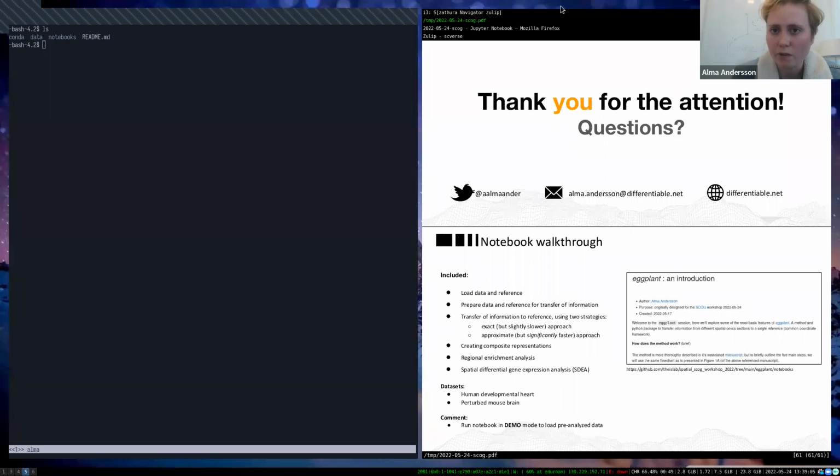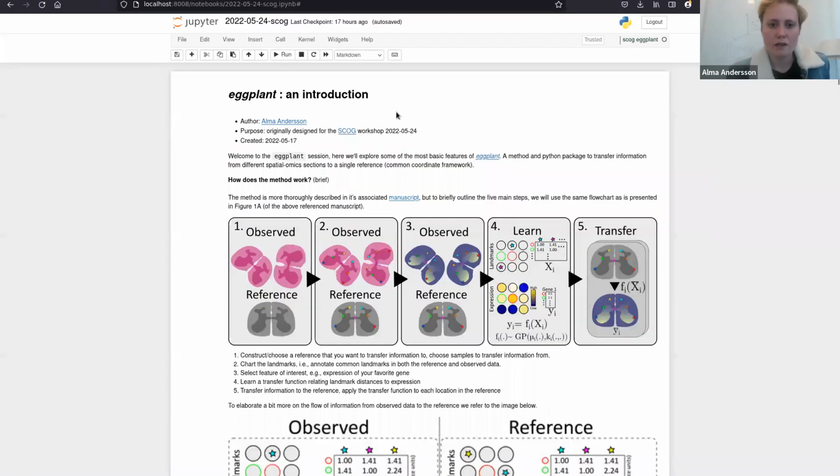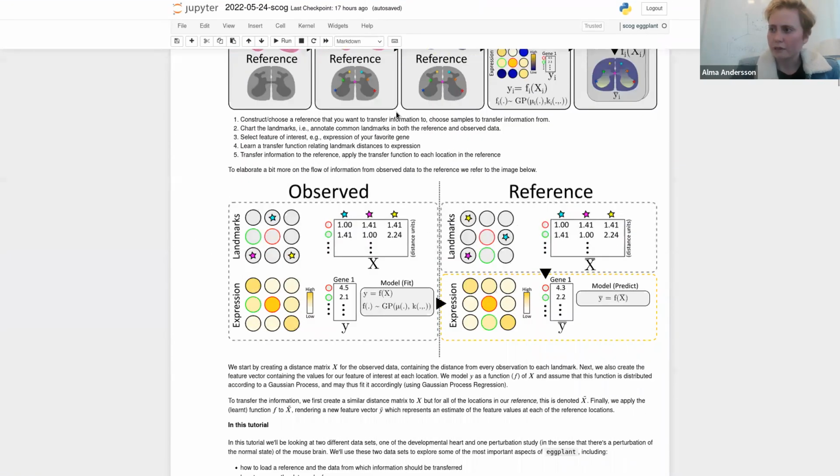So with that being said, I can move on to actually opening the notebook here. Excuse me, let me take some water.